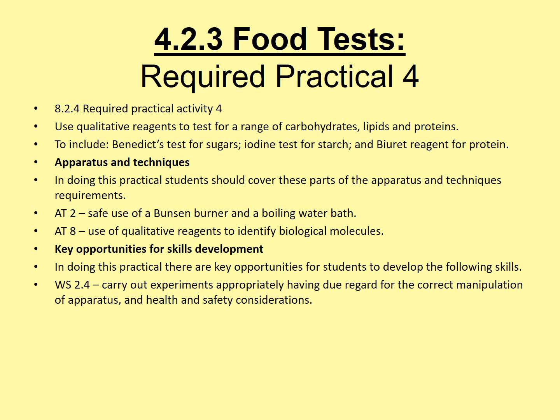This is, again, a lesson for Biology Paper 1, and this is one of the required practicals. It's required practical number 4, and it's food tests. So this is the specification. You have to be able to test for carbohydrates, and within carbohydrates, it's sugars and starch, lipids and proteins.